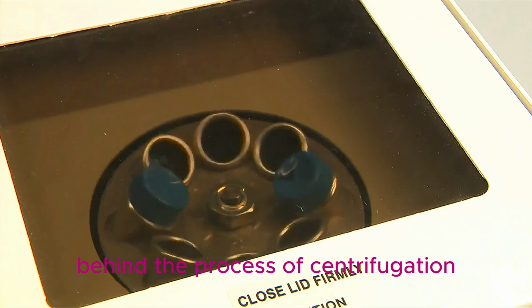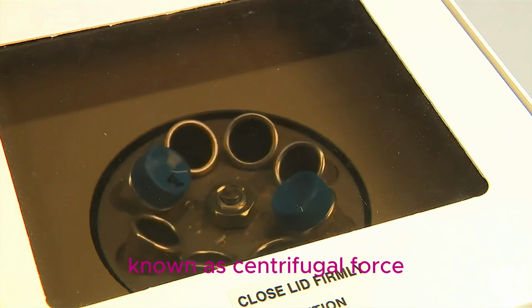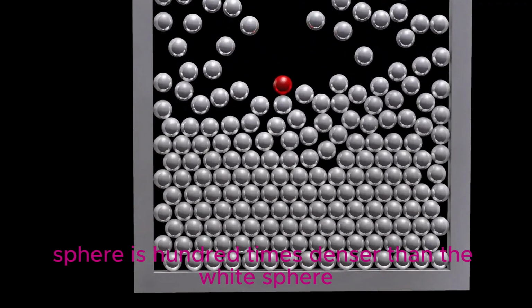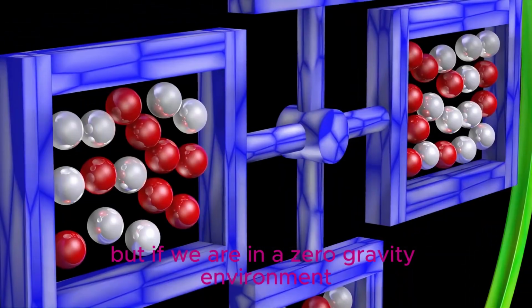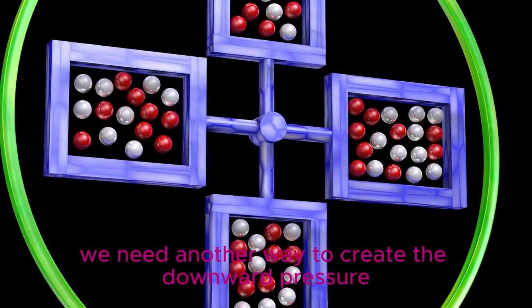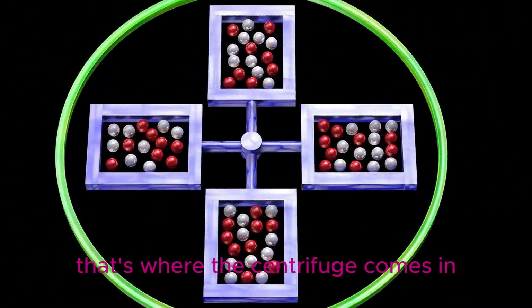Behind the process of centrifugation, there is a physics concept known as centrifugal force. In this environment, the red sphere is 100 times denser than the white sphere. Under normal pull of gravity, it quickly sinks to the bottom. But if we are in a zero gravity environment and still need to separate these particles, we need another way to create the downward pressure. That's where the centrifuge comes in.